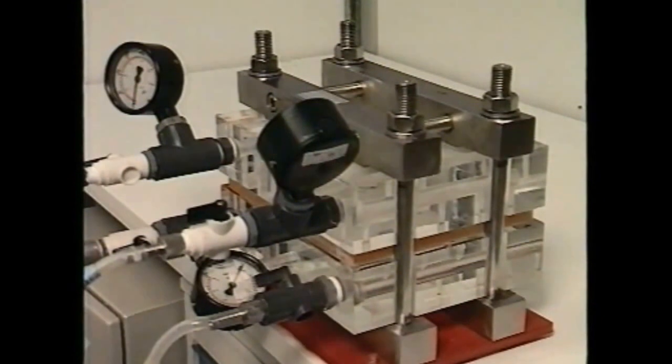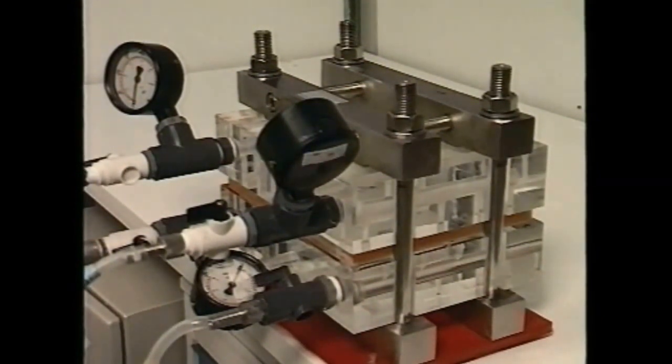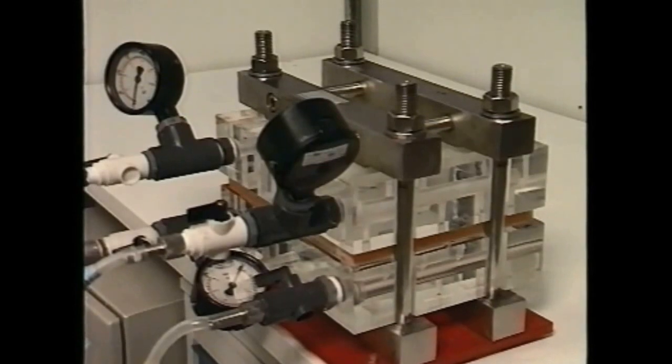Unfortunately, the traditional separation methods are far from ideal in many respects. They impose undesirably high shear stress on the cells, a form of stress that mammalian cells are particularly sensitive to. They often produce inadequate separation efficiency.